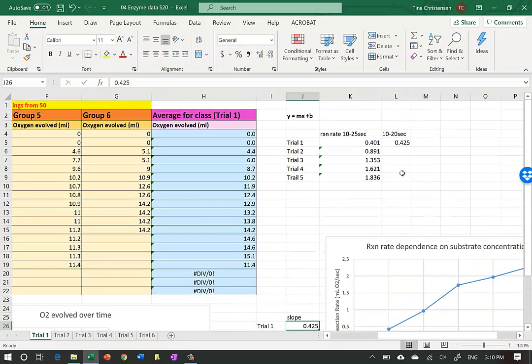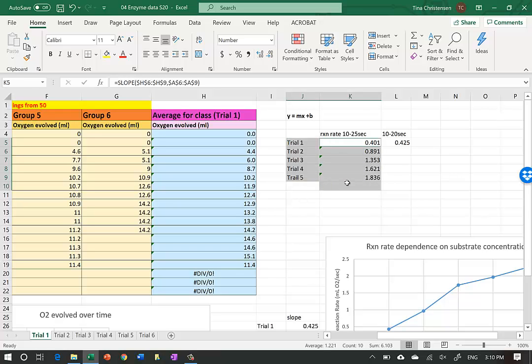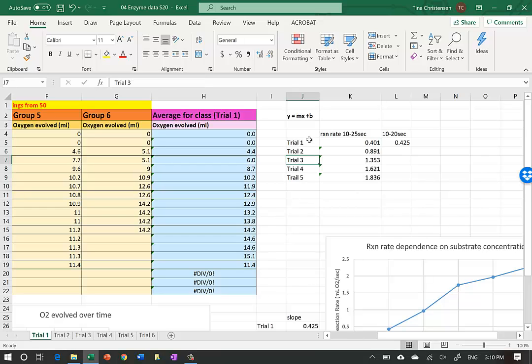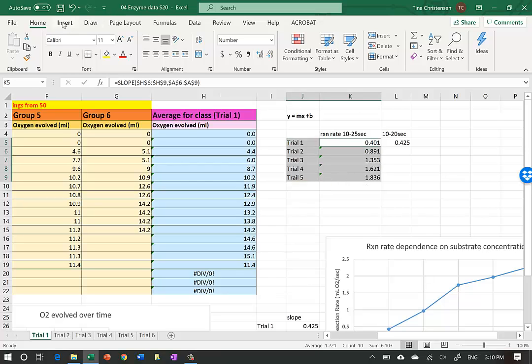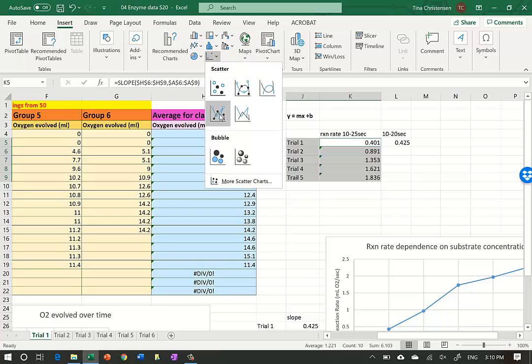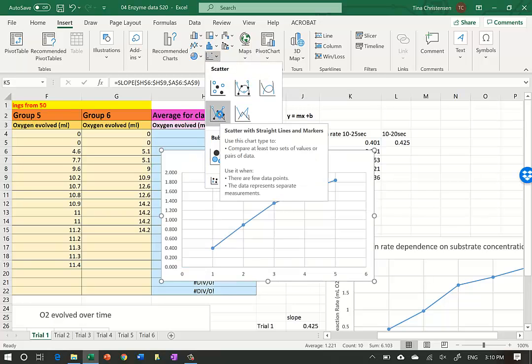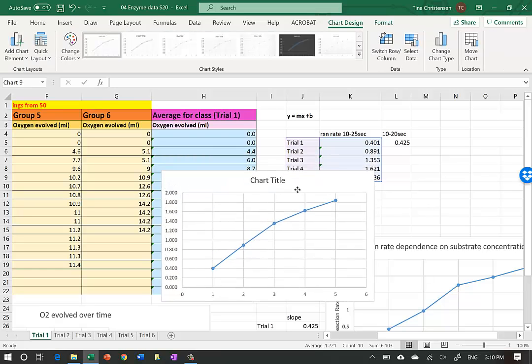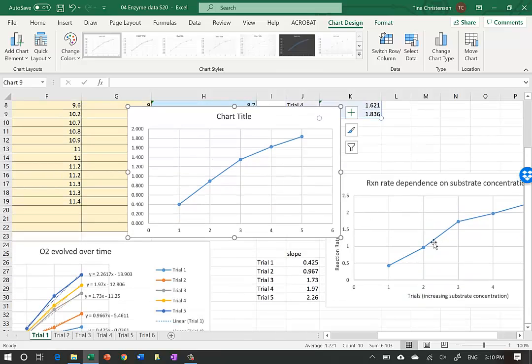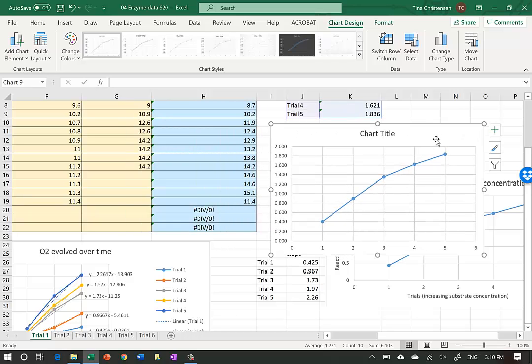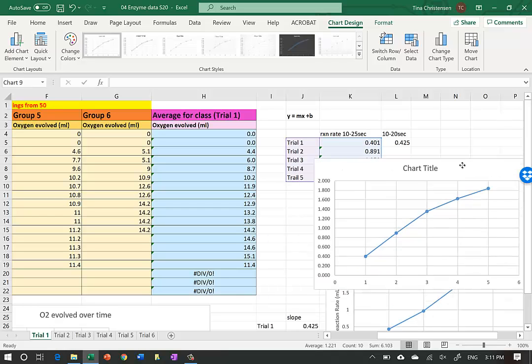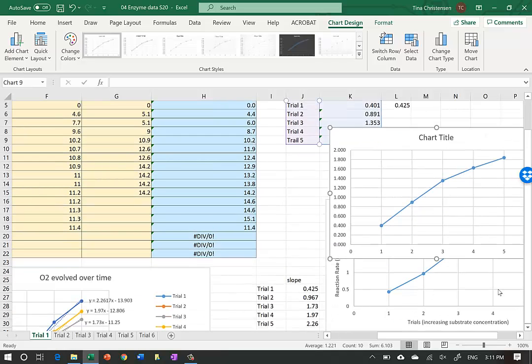We can also quickly graph these slope values. I highlight the trial names, hold Ctrl to highlight the slope values, do Insert, then XY scatter with connected dots. This graph looks slightly different from the original one because these slopes use a different time interval than the previous table. The two methods give different values because the intervals used are not identical.